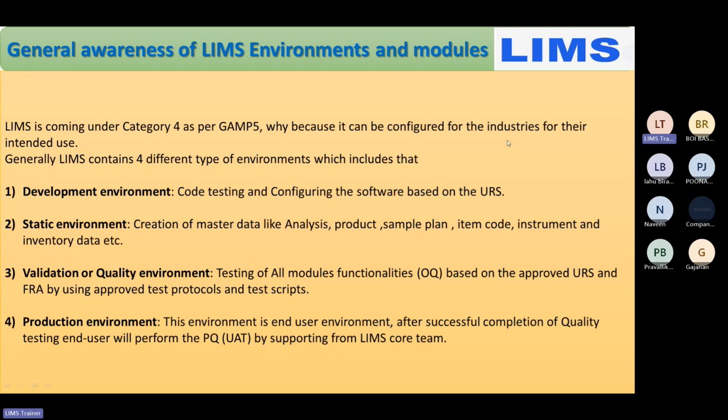I suggest you go with all the categories. Read all the categories and remember them. That is the main question whenever you go for interviews related to LIMS and also other software. Generally, LIMS contains 4 different types of environment.